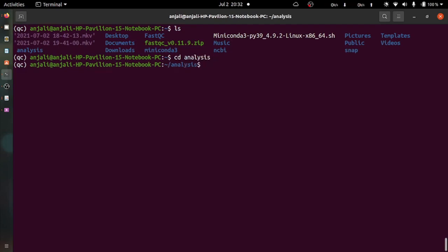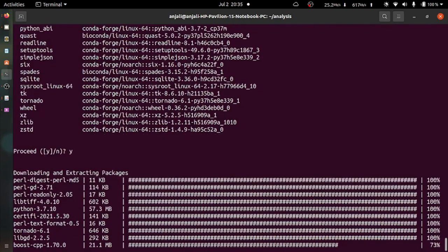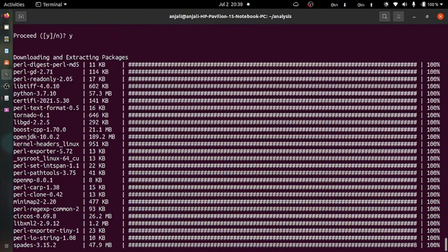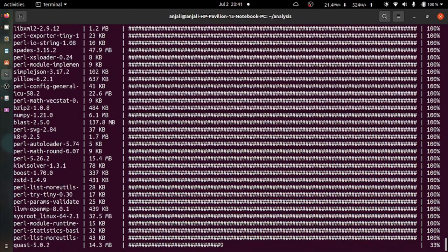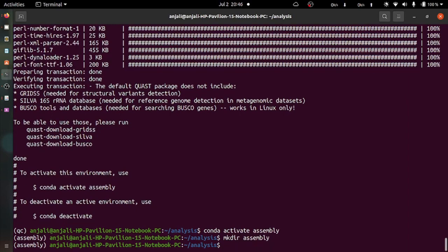Now we want to create a genome assembly for our ancestor. We are going to use the quality trimmed forward and backward DNA sequences and use a program called Spades to build a genome assembly. In a recent evaluation of assembly software, Spades was found to be a good choice for fungal genomes. Firstly, we'll change to our analysis root folder and we'll create an output directory for the assemblies. Then we'll submit the paired-end data.